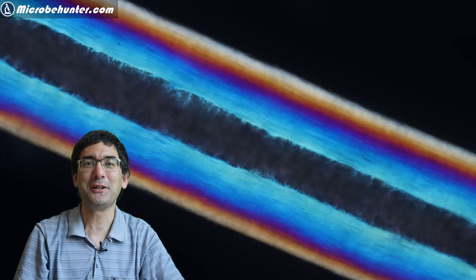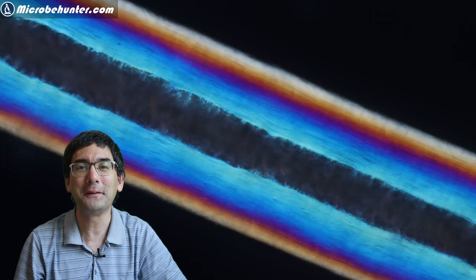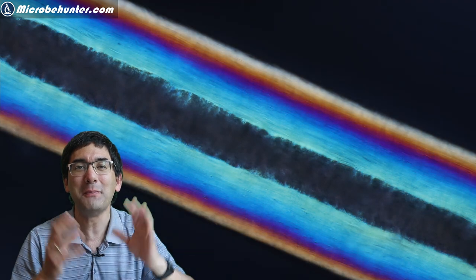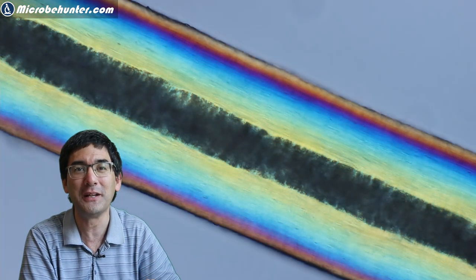Hi, hello and welcome. Microbe Hunter here again. Today no microbe hunting, but rather I wanted to make a video that makes you guess what you're looking at.